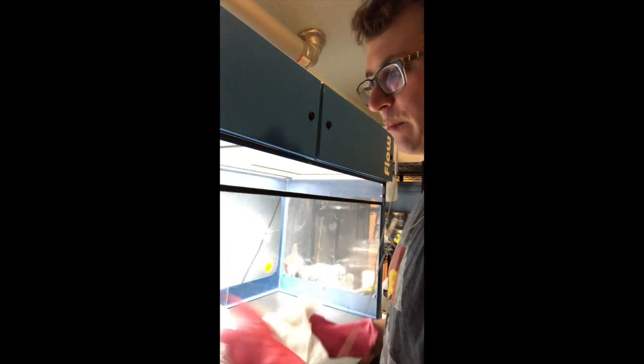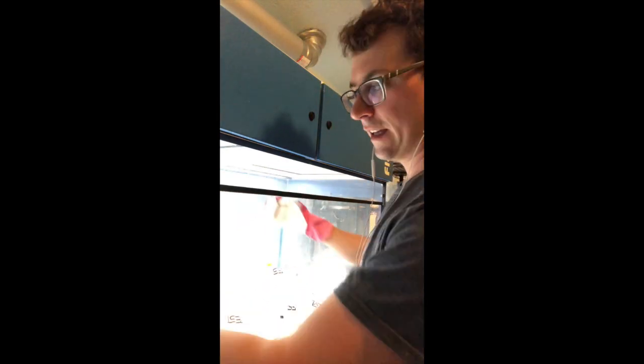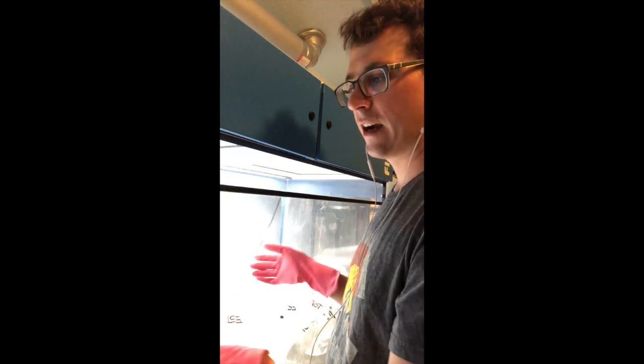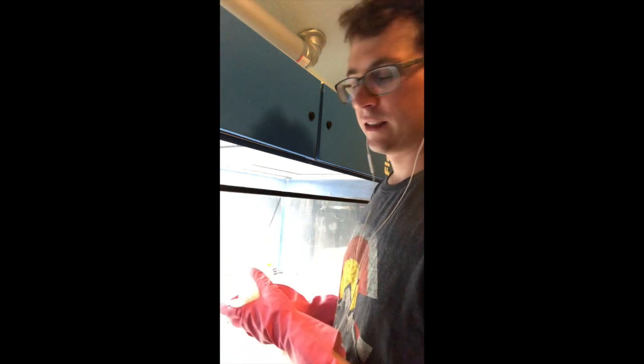Someday I hope to get a stainless steel casing. The plastic eventually gets corroded from the bleach, which doesn't really affect anything, but it's just kind of aesthetically noticeable. So whenever I'm cleaning my hood, I'm going from top to bottom, and then from back to front. I want to wipe all the particulates and any dust that might be in there. I clean this hood daily, so I know that it's going to be clean. But if you're getting a new hood, or you haven't used it in a while, you really want to do a thorough job, especially when you're pouring plates.